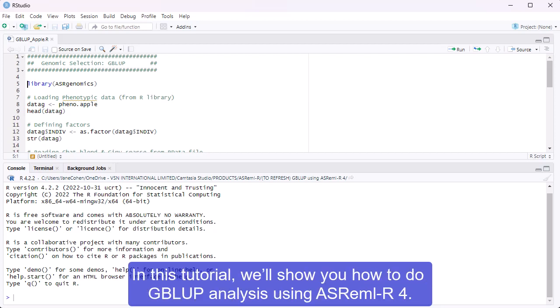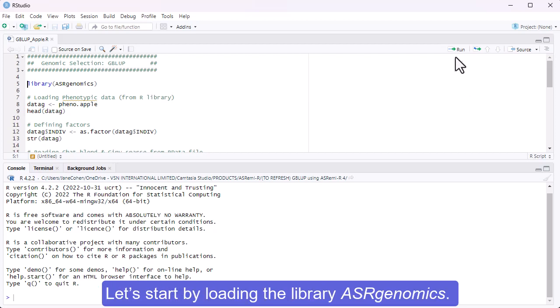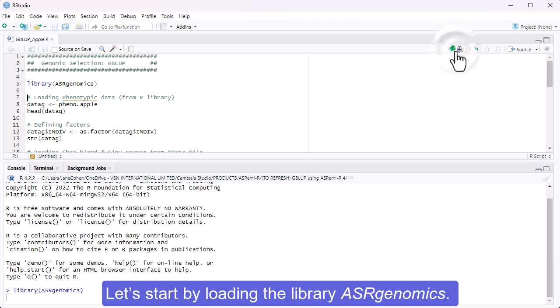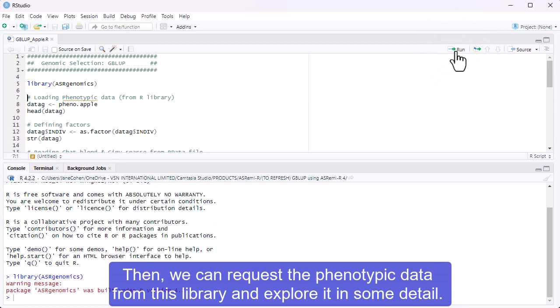In this tutorial, we'll show you how to do GBLUP analysis using ASREML-R4. Let's start by loading the library ASR Genomics. Then we can request the finitivic data from this library and explore it in some detail.